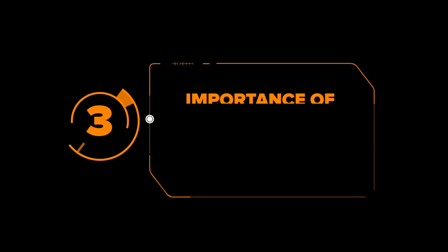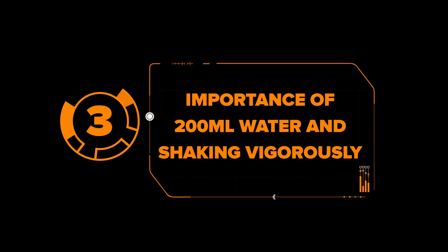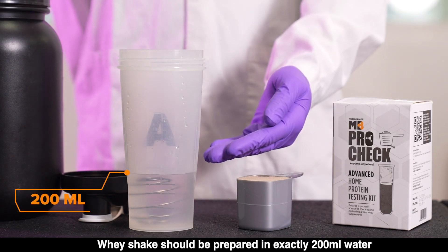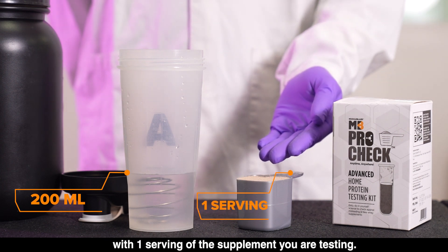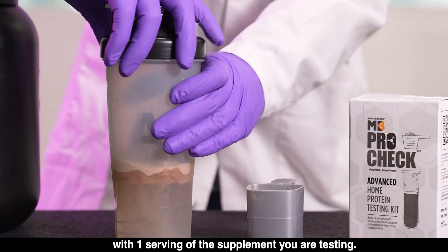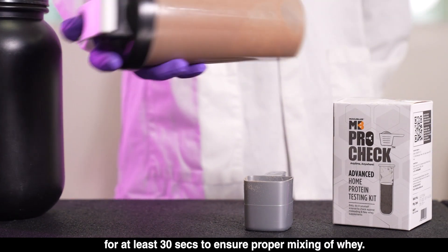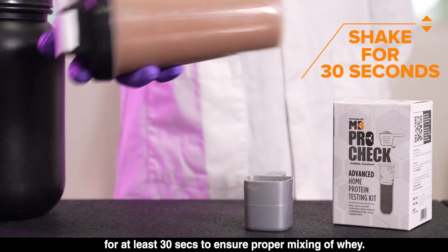Mistake 3: Importance of 200 ml water and shaking vigorously. The whey shake should be prepared in exactly 200 ml of water with one serving of the supplement you are testing. Then you must vigorously shake the shaker for at least 30 seconds to ensure proper mixing of whey.